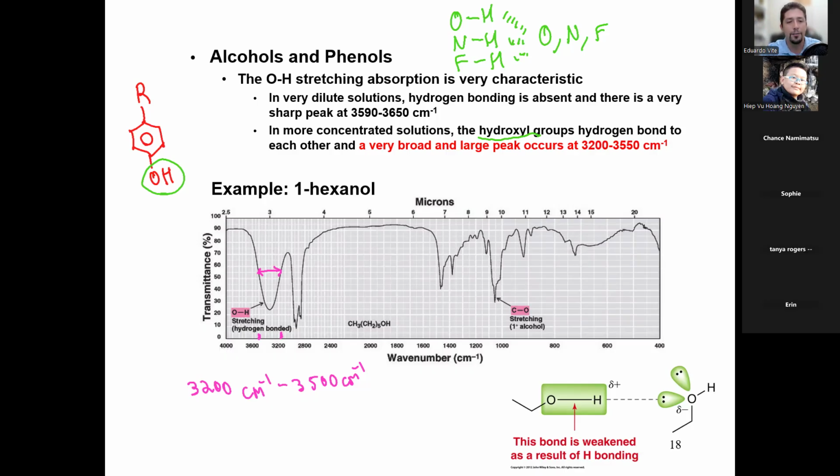What is this right next to the OH? I'm going to use the color ice blue. What is this right here? At 3000. What is that in the blue? CH bonds, exactly, right? And it says here that it's hexanol, so you know that it is sp3 CH stretches, right? sp3 CH stretches. And that's always going to be in all of your spectra because of organic chemistry's definition. And that's really all we look at.